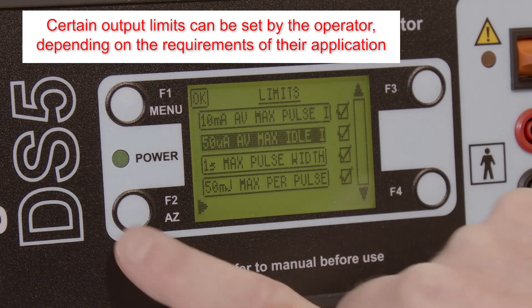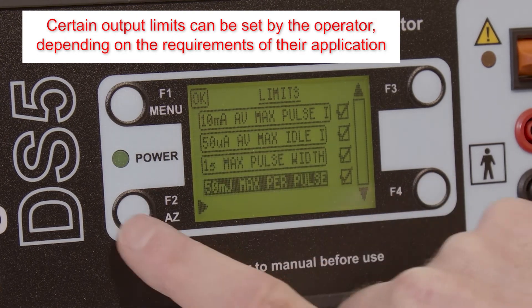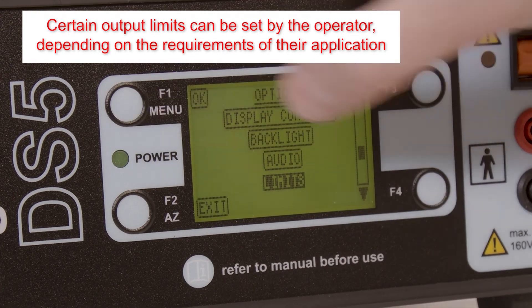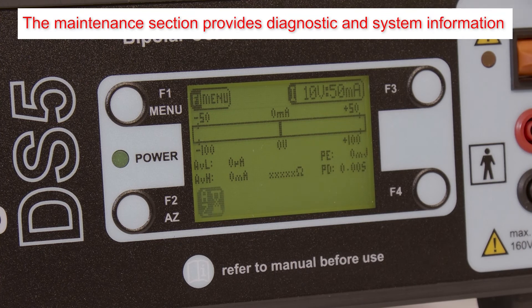All limits are enabled by default but can be disabled by unticking the checkbox within the menu. The maintenance section provides access to diagnostic and system information, as well as allowing the operator to restore the DS5 to factory settings.